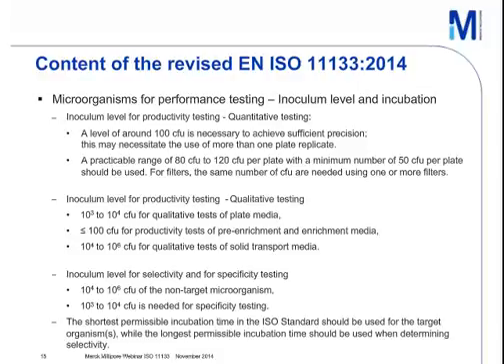For the incubation time, the shortest permissible incubation time in the ISO standard should be used for the target microorganisms, while the longest permissible incubation time should be used when determining selectivity. This is very new in the standard, and it is nearly like the definition for incubation in quality control of media given by the pharmacopoeia.